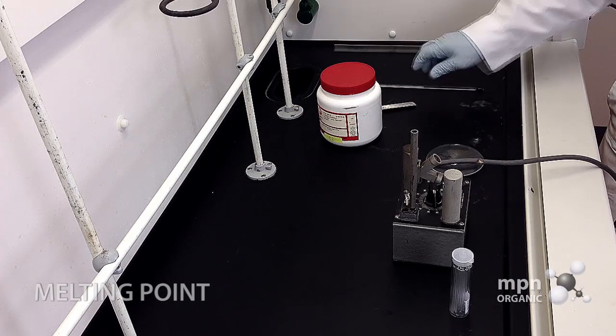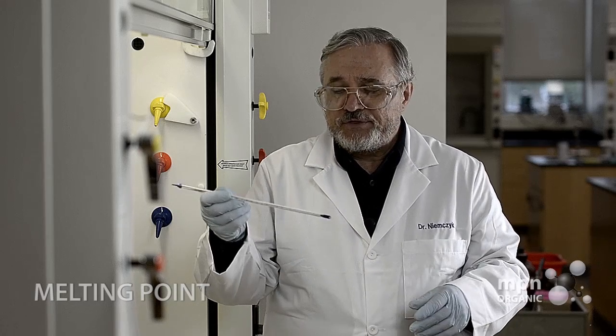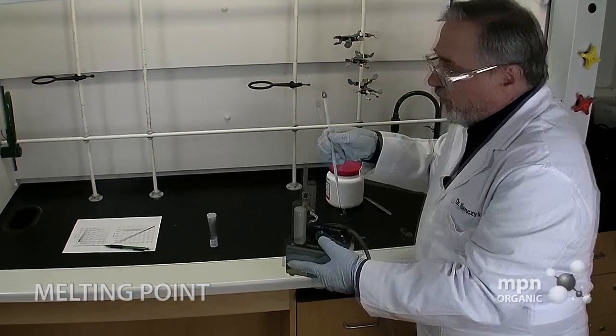Okay, so that's the first thing. We have the transcinnamic acid. The second thing that we have to provide is a thermometer. Now these thermometers are going to fit in what we call these thermometer wells.